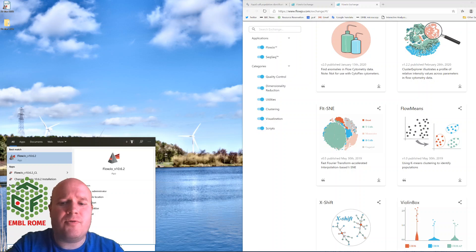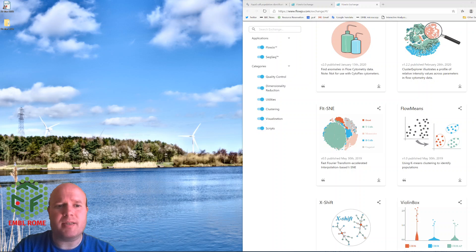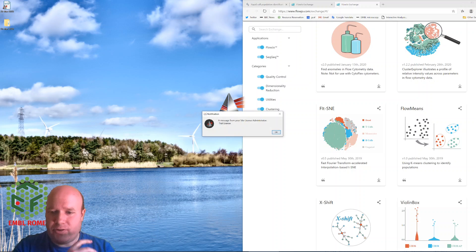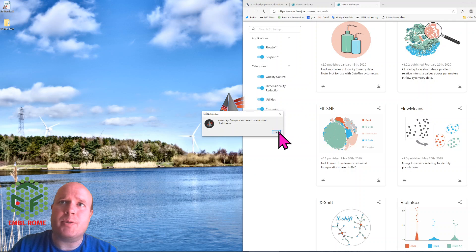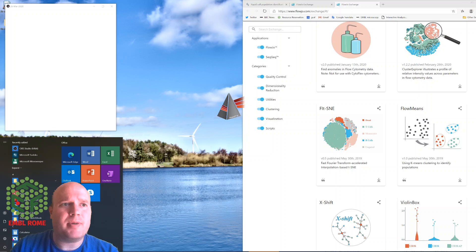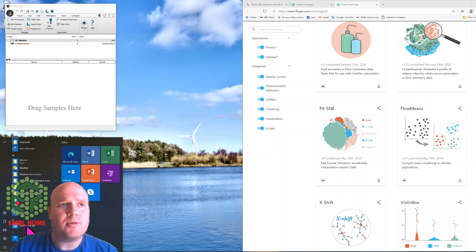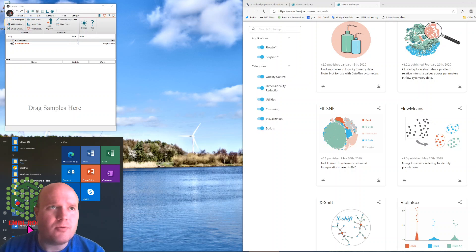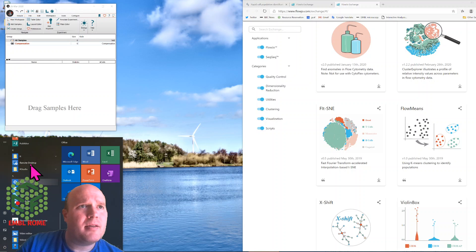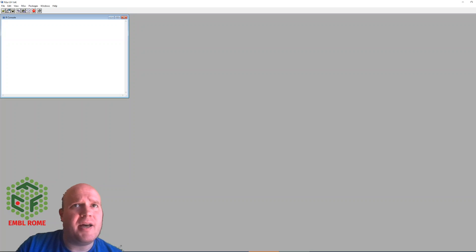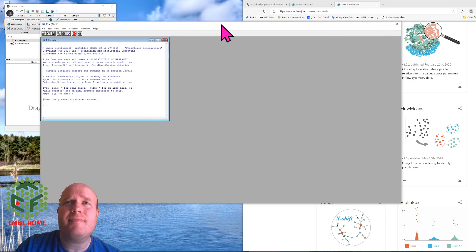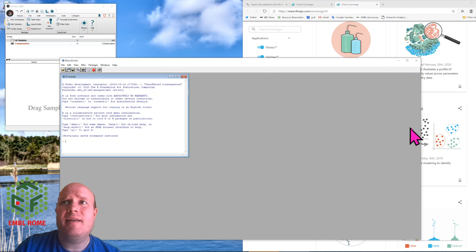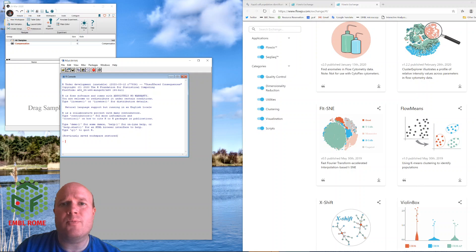As I said, what FlowJo does is it loads the R package FlowMeans. So after downloading the plugin you also need to install FlowMeans into R. In my case I go to my Windows icon, go down, that's over my shoulder, click on R, and that opens up this R console.